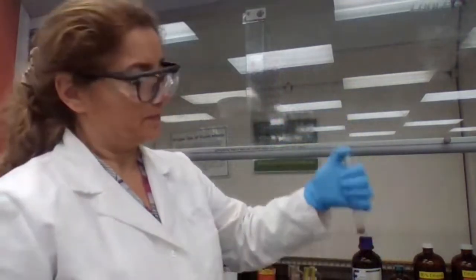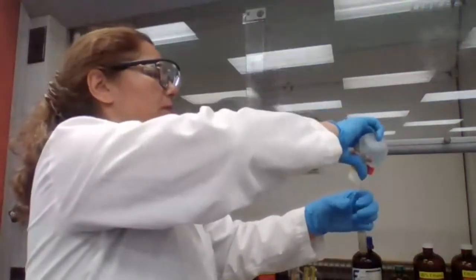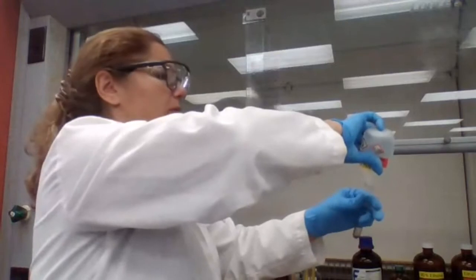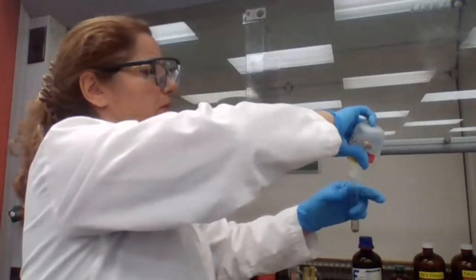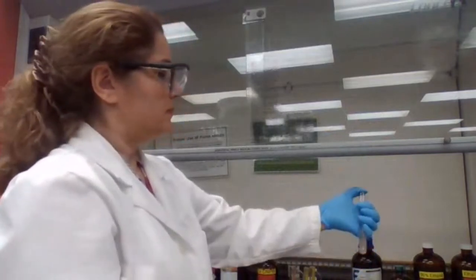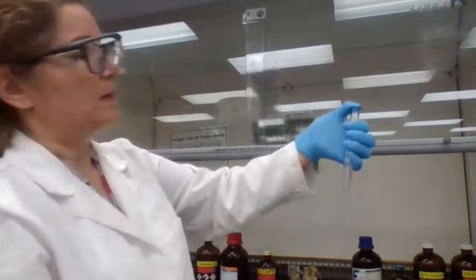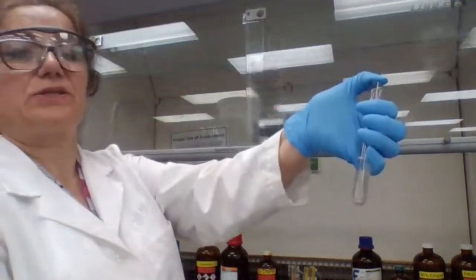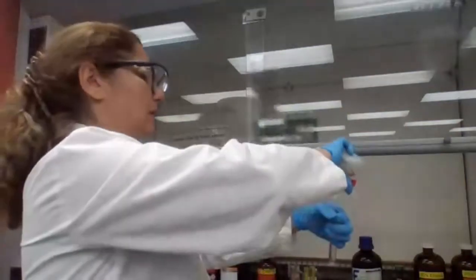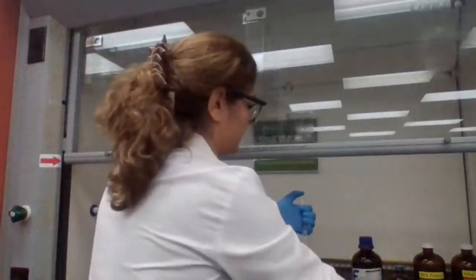Very good. Okay, the precipitate dissolved in the basic solution with the presence of ammonia. In ammonia solution, the precipitate dissolved.